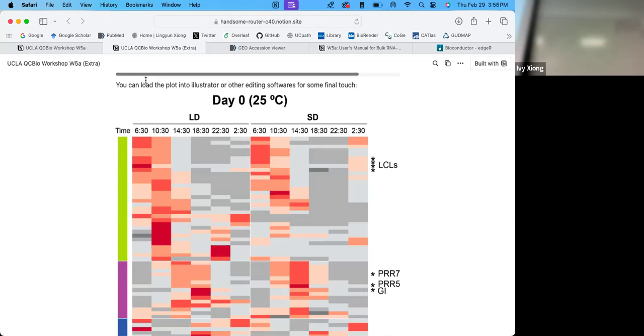No, I think this is the two stages. What she wanted, I think. The first thing we ran was the sum, and that was like quality control again. I remember doing this yesterday. We finished this, and then just really to be aligned with it.